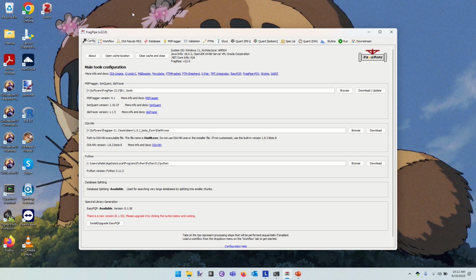Okay. All right. There are some advanced features that can be used, especially in scenarios where you have a very large database of peptides you need to compare to. Database splitting can be useful for that. In a case like that, there are certain libraries that need to be installed in Python for that to be feasible, pandas or NumPy or something. That, I think, is handled automatically in the newer versions and not in my older version.